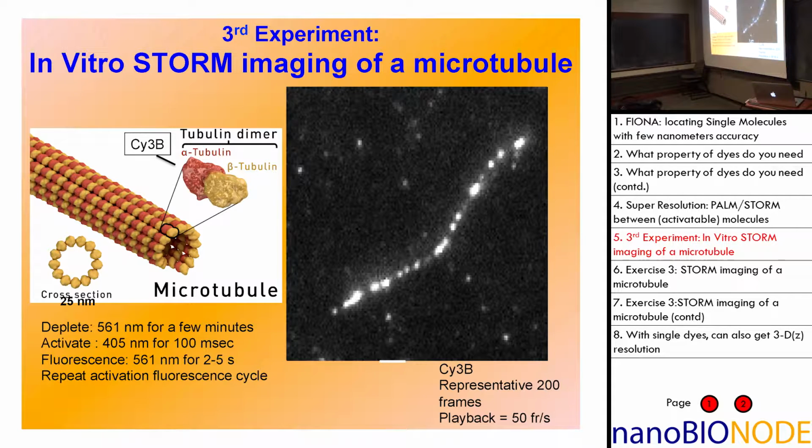Although it becomes somewhat tricky because if the two dye molecules are only like 10 nanometers apart, you'd still get, okay, maybe 260 nanometers, and you think, that may or may not be two molecules. Although, in general, this will be twice as high as this. Yeah, that's right.